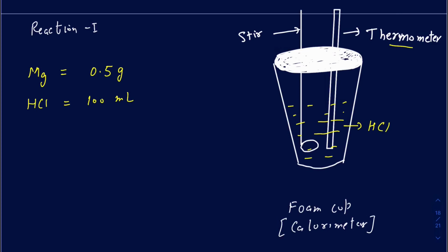So I have my HCl in this calorimeter cup, and then I need the initial temperature of the HCl as well. Once you put the HCl in the cup, you have to leave it there for about 5 minutes or so, just to make sure that both the calorimeter cup and your HCl are in thermal equilibrium, and then read the initial temperature. Let's say the initial temperature, I'm just going to pick a room temperature, is about 22.0 degrees Celsius.